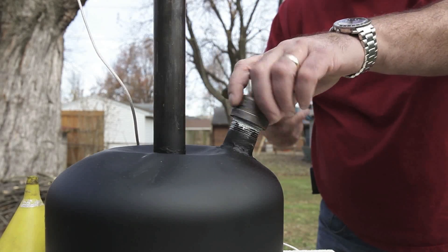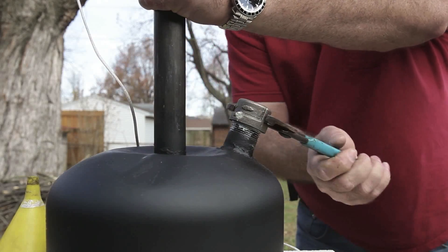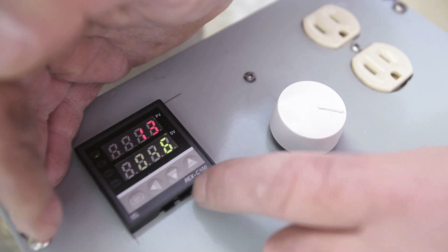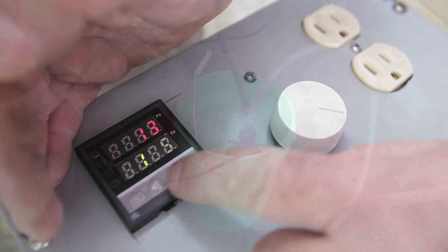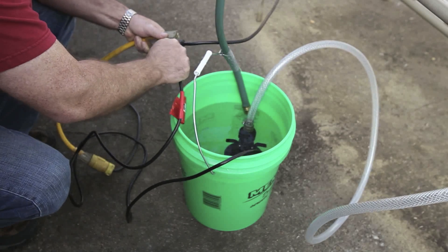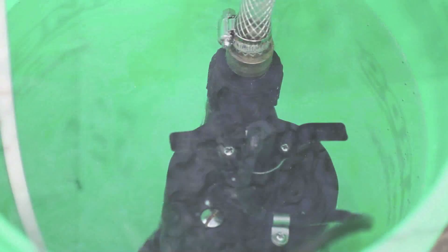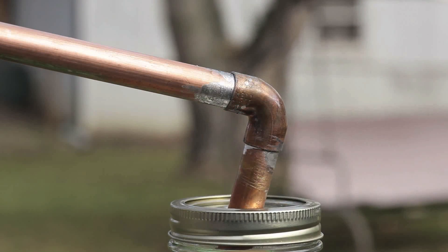Put the lid back on, get it good and tight. Now we're setting the end point of the PID temperature control — we're going to set that at 155 degrees Celsius. Now we're going to turn on the water flow to the condenser, just using a 5 gallon bucket here. Seal everything up, close it off with the thermal bricks. Water is flowing good, temperature is good.